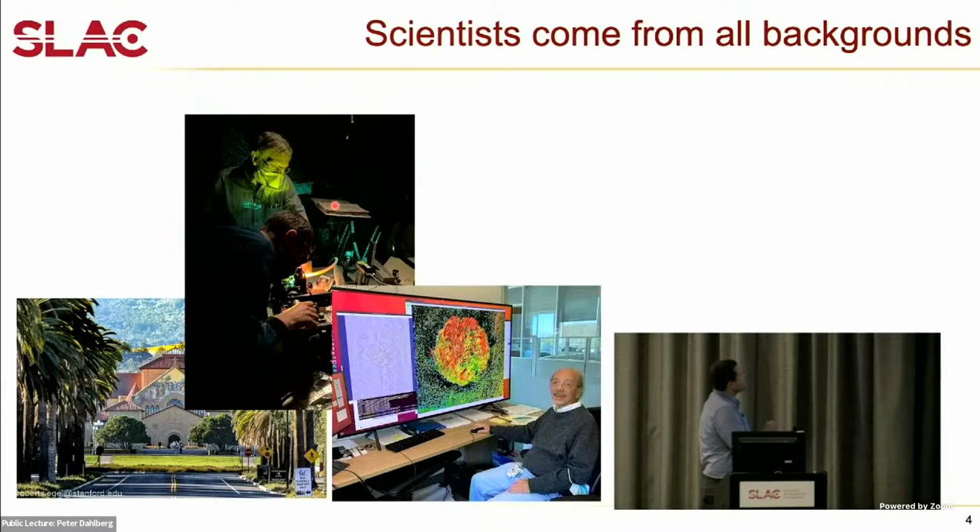So W.E. Moerner is an expert and early developer of super resolution fluorescence microscopy. And as Michael said, he got that Nobel Prize in 2014 in chemistry for his foundational work in this area. And Wah Chiu is a real expert and pioneer and developer of cryogenic electron microscopy. So these are the two methods that I'm going to be bringing together later on in the talk: cryogenic electron microscopy and super resolution fluorescence microscopy.